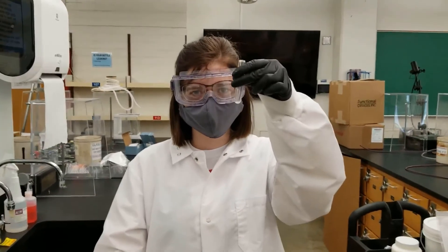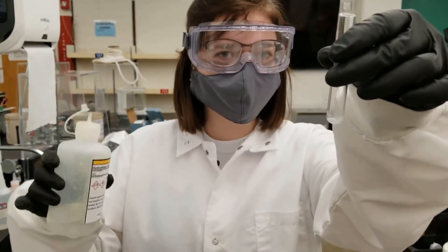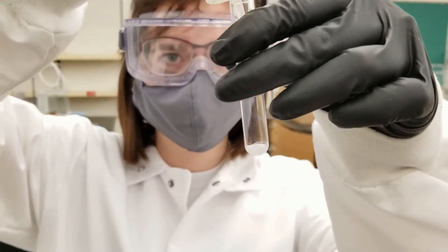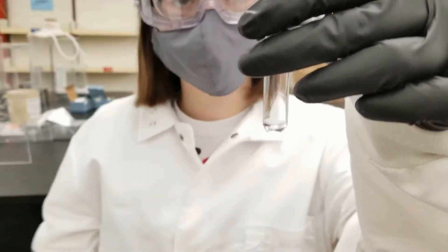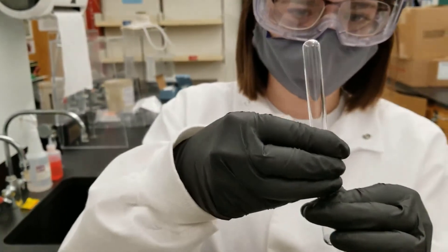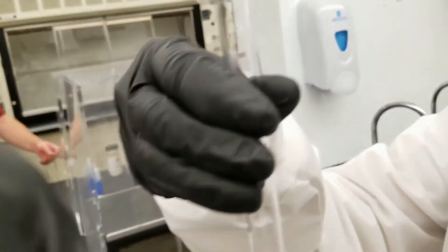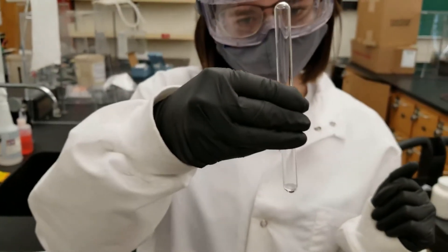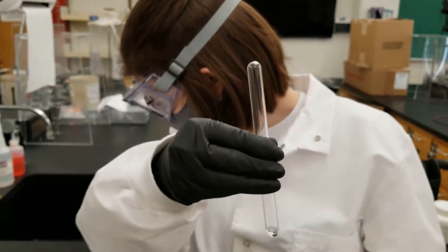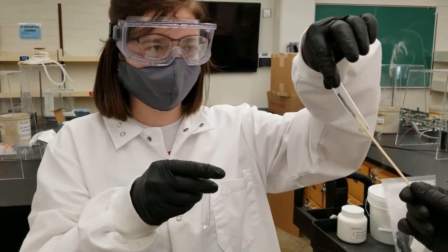I have the precipitate here from the experiment we just did and now I am going to add a few drops of hydrochloric acid, and then we are going to try to collect the escaping gas to see what is forming. We are going to wait a little bit to let the gas form and fill the test tubes, and then we are going to do a burning splint test. And it went out. Beautiful.